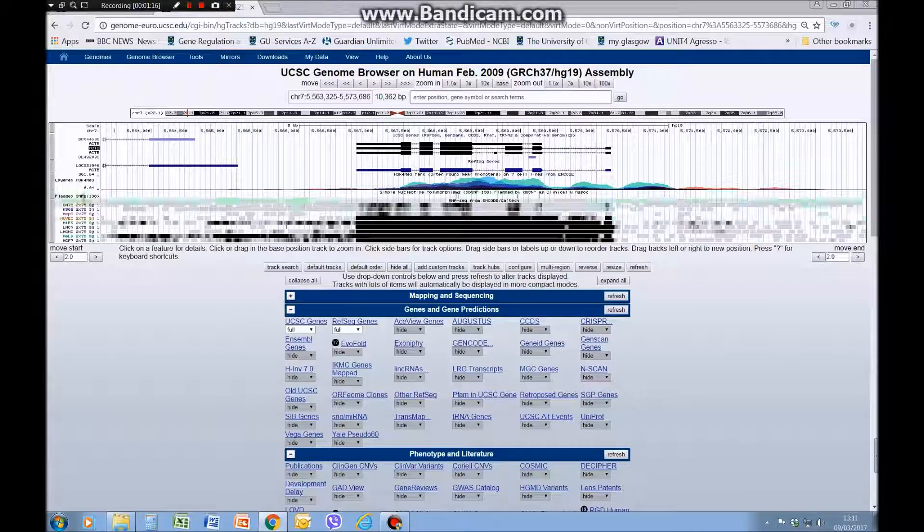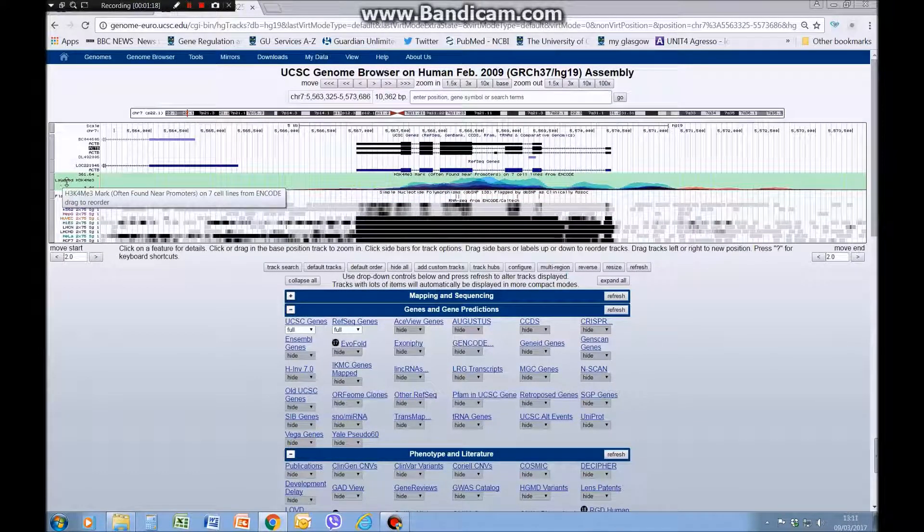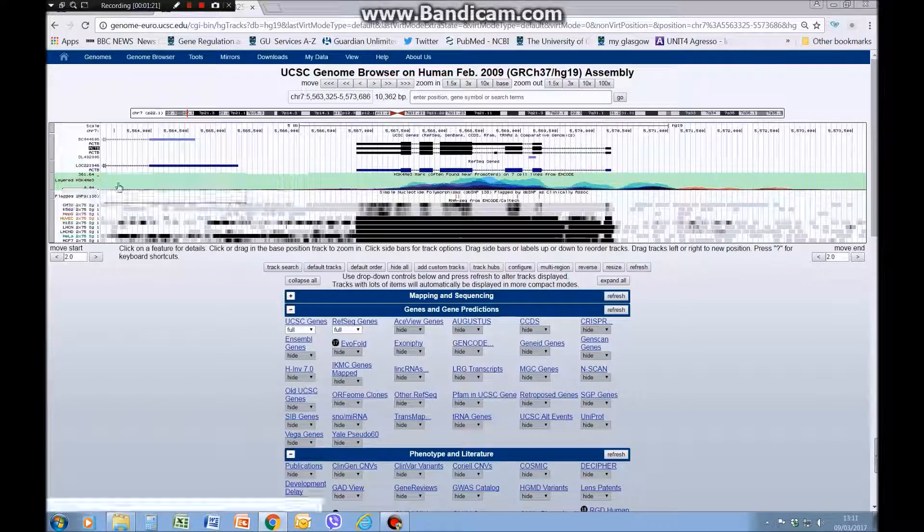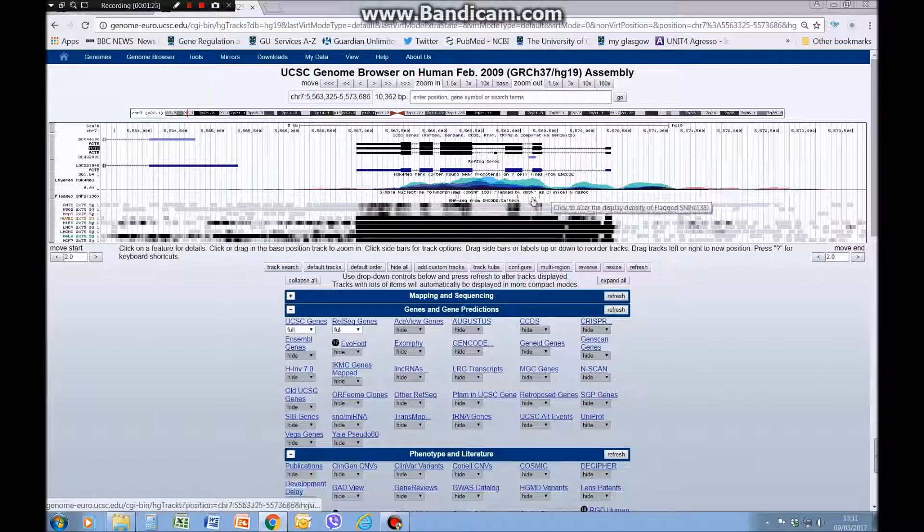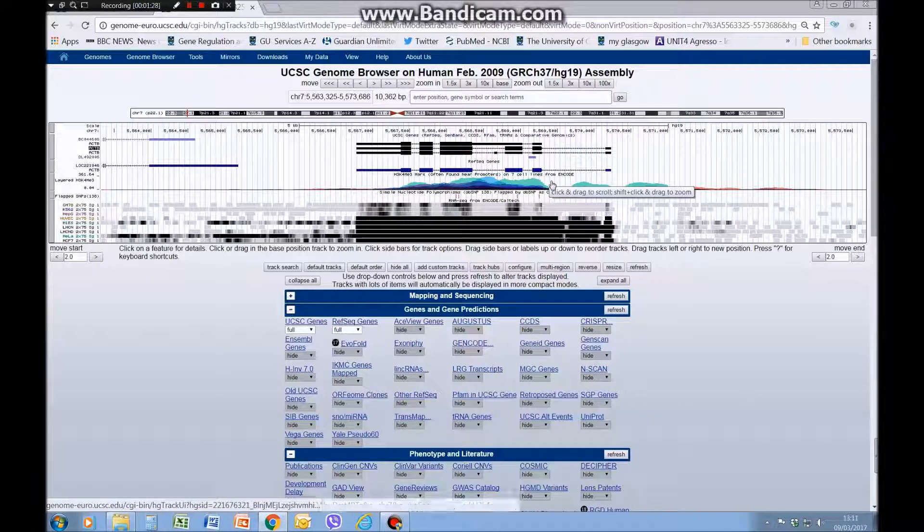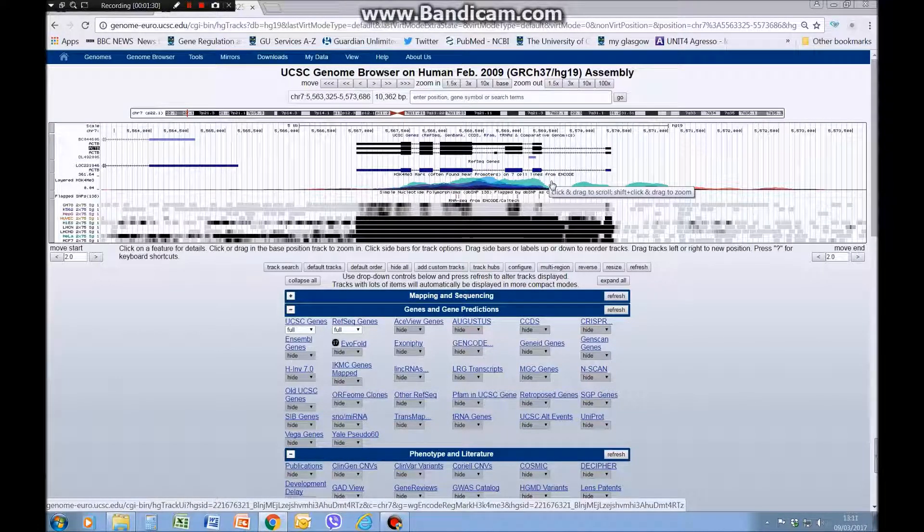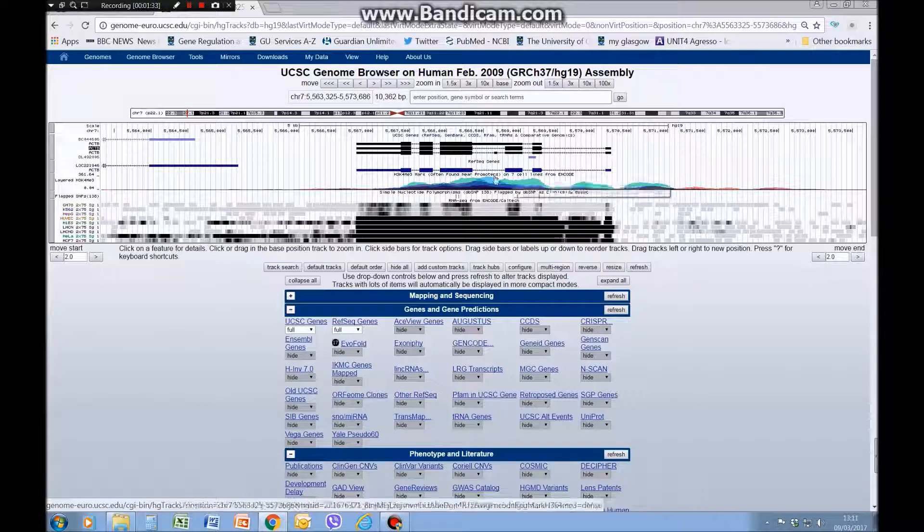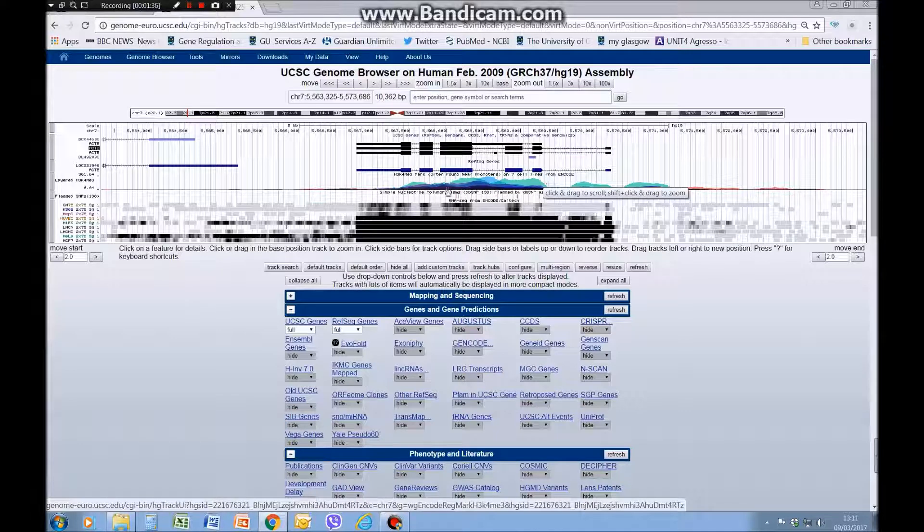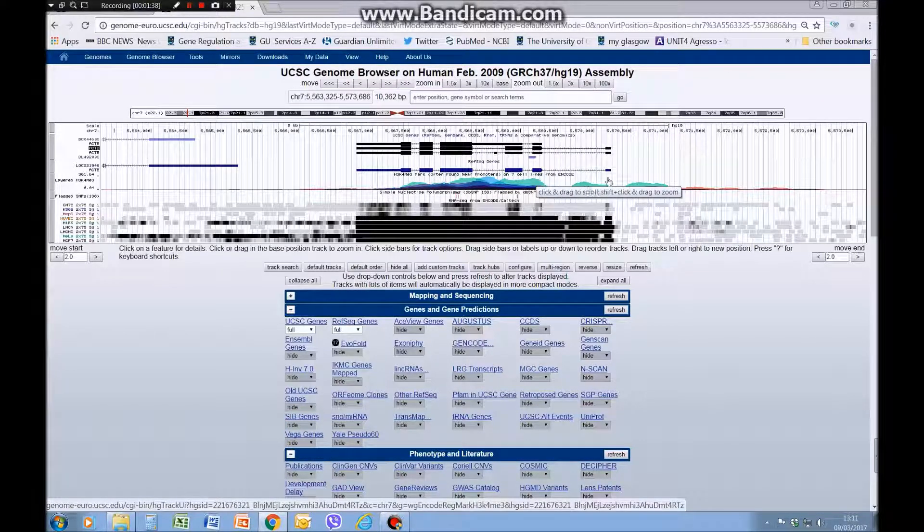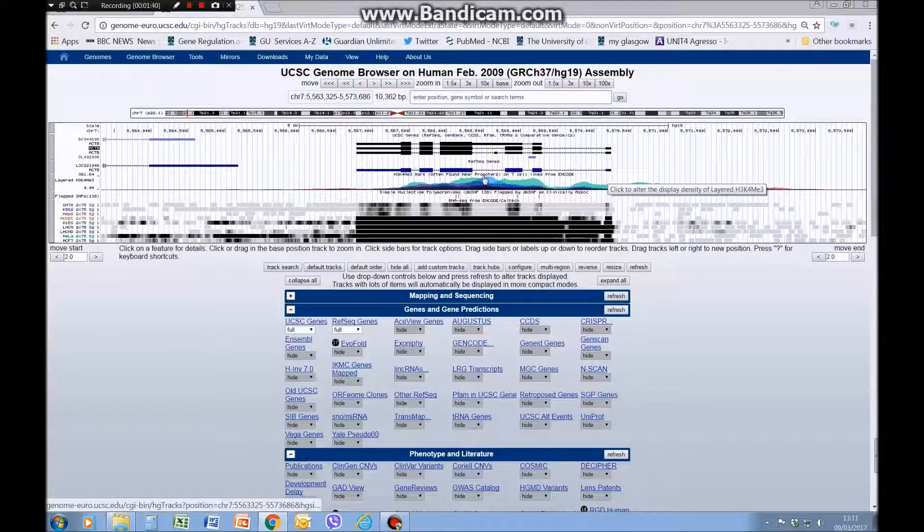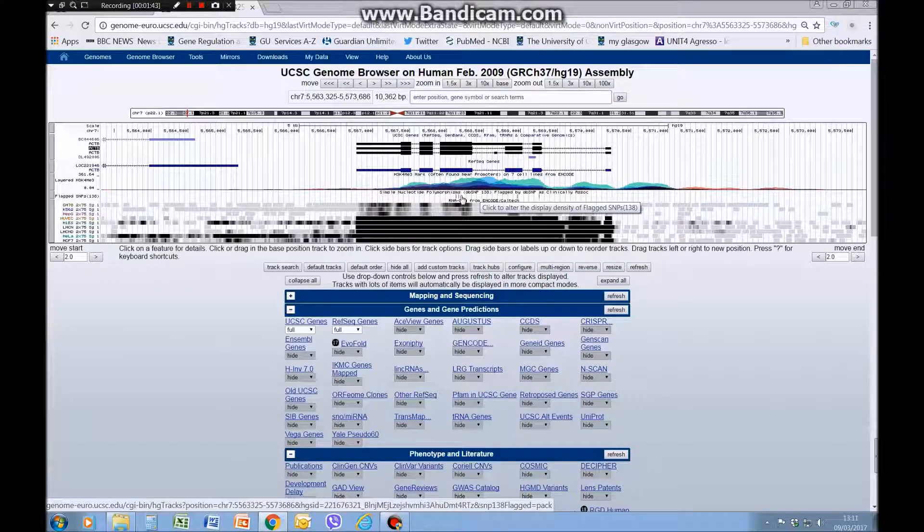So now here we have the H3 lysine 4 trimethyl data and it's layered, so basically each color is a different cell line. You can see the amalgamation and get a feel for where in most cell lines this particular mark is found. We have a large peak of this promoter modification, and I say promoter but often we find it downstream of the actual transcription start site.